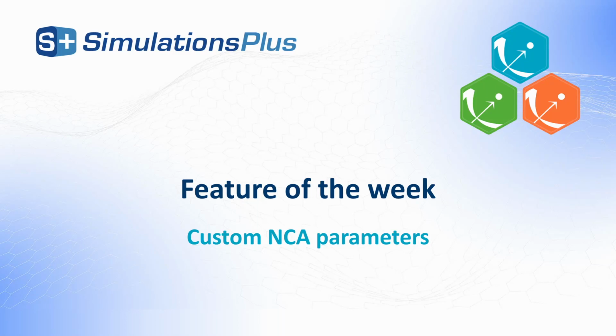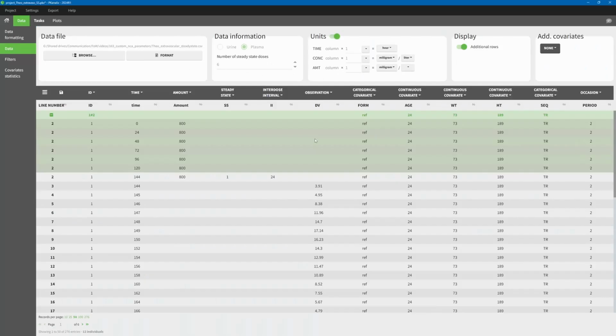In this video, we will show you how to define additional NCA parameters via formulas that use NCA parameters that PKanalix can calculate by default and values of continuous covariates. As an example, I will show you how to calculate the Cmax one would obtain after a single dose using concentration data at steady state.